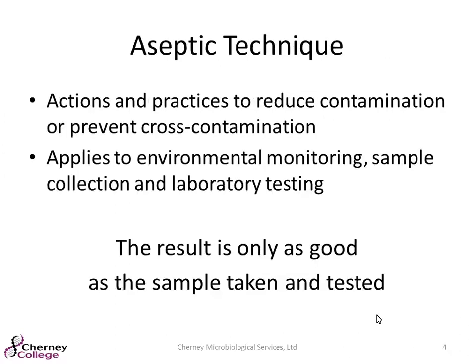Okay, good morning, everybody. Today we're going to be talking about aseptic technique. I am not going to be solely focused on micro. We will be talking about some basic micro sampling and testing, but we will also touch on some of the more typical chemistry tests that you may be performing in-house. When we talk aseptic technique, that's actions and practices to reduce contamination or prevent cross-contamination.